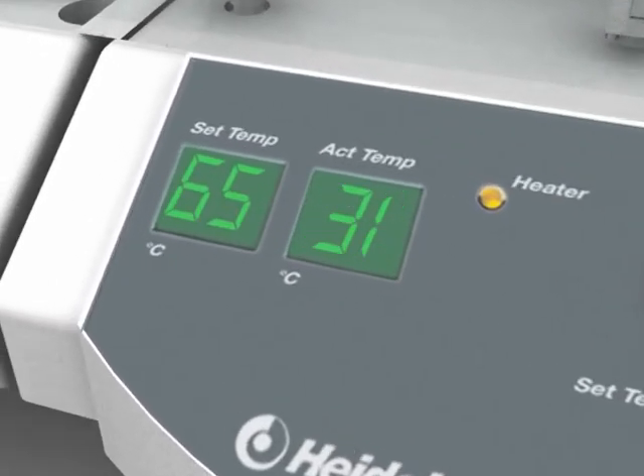Digital temperature settings up to 65 degrees Celsius with a separate display for actual temperature.